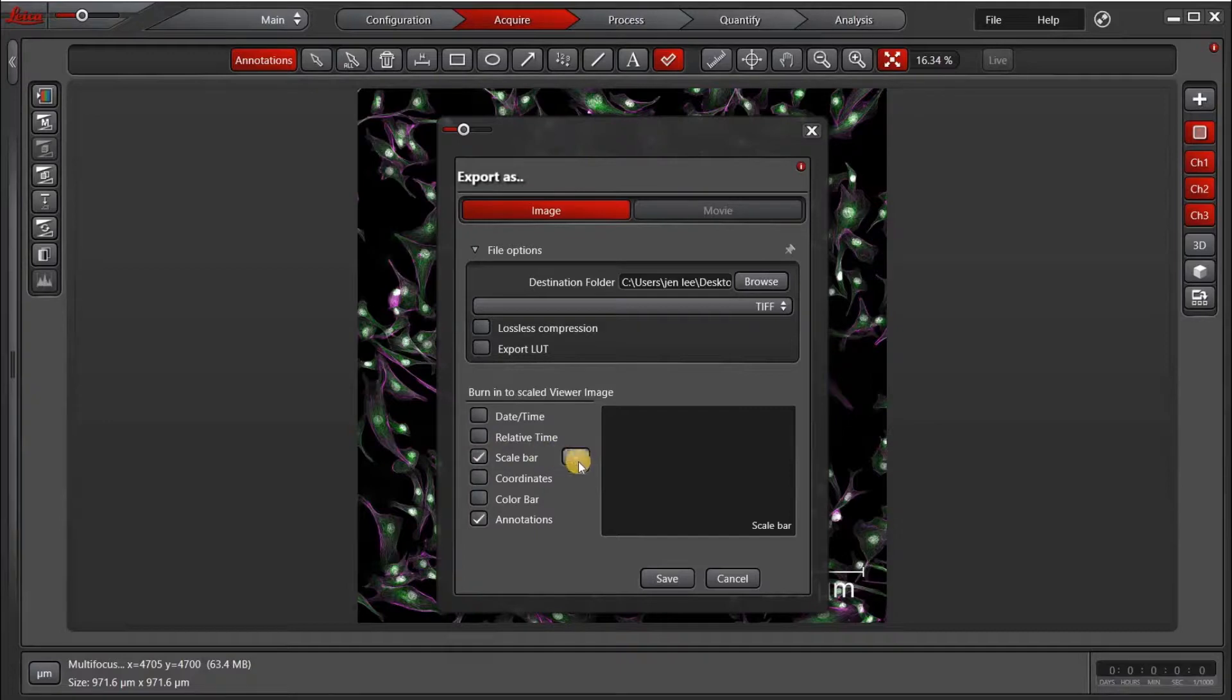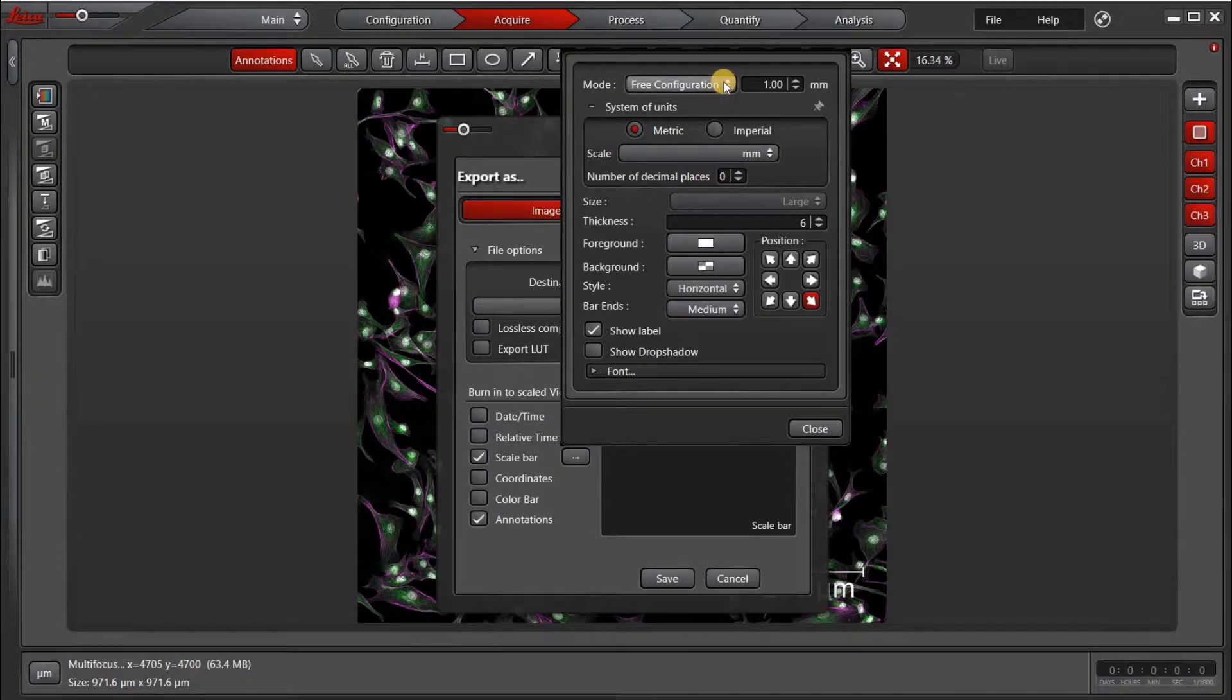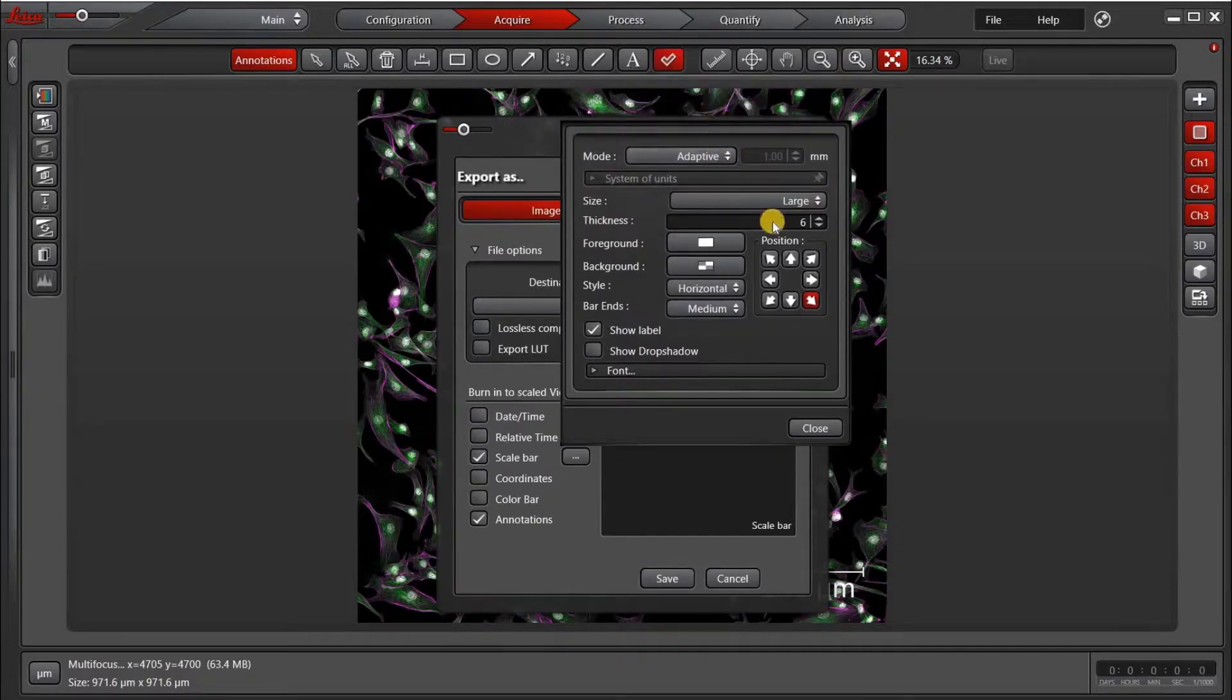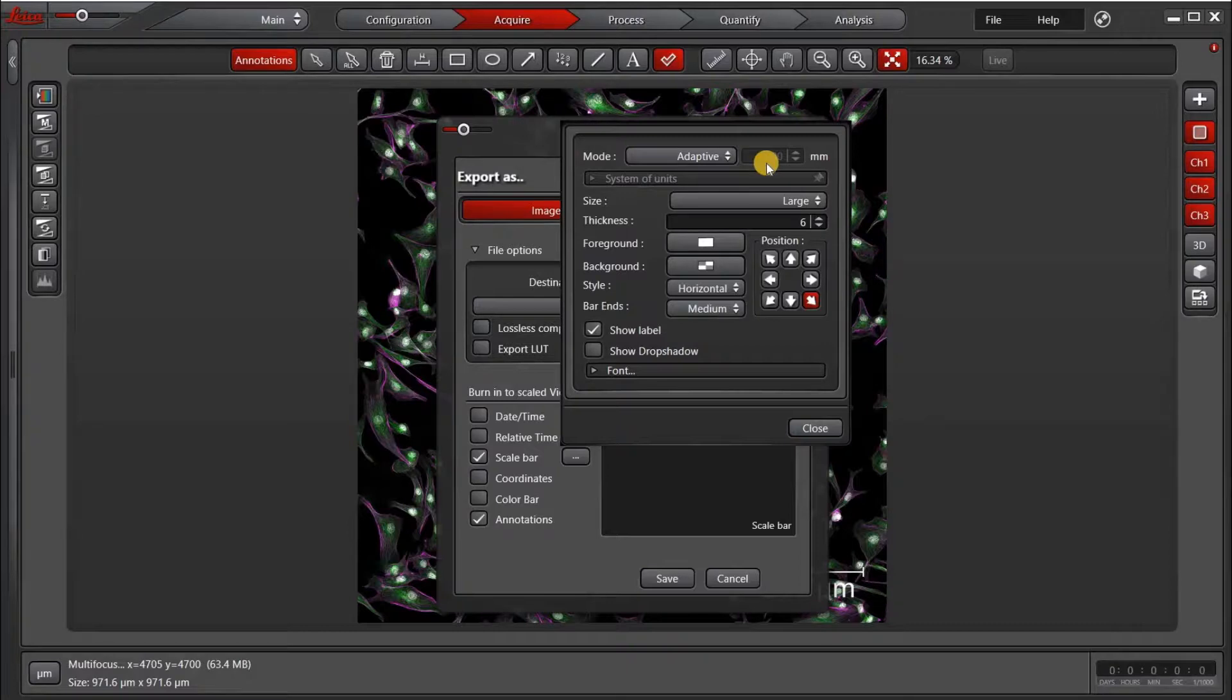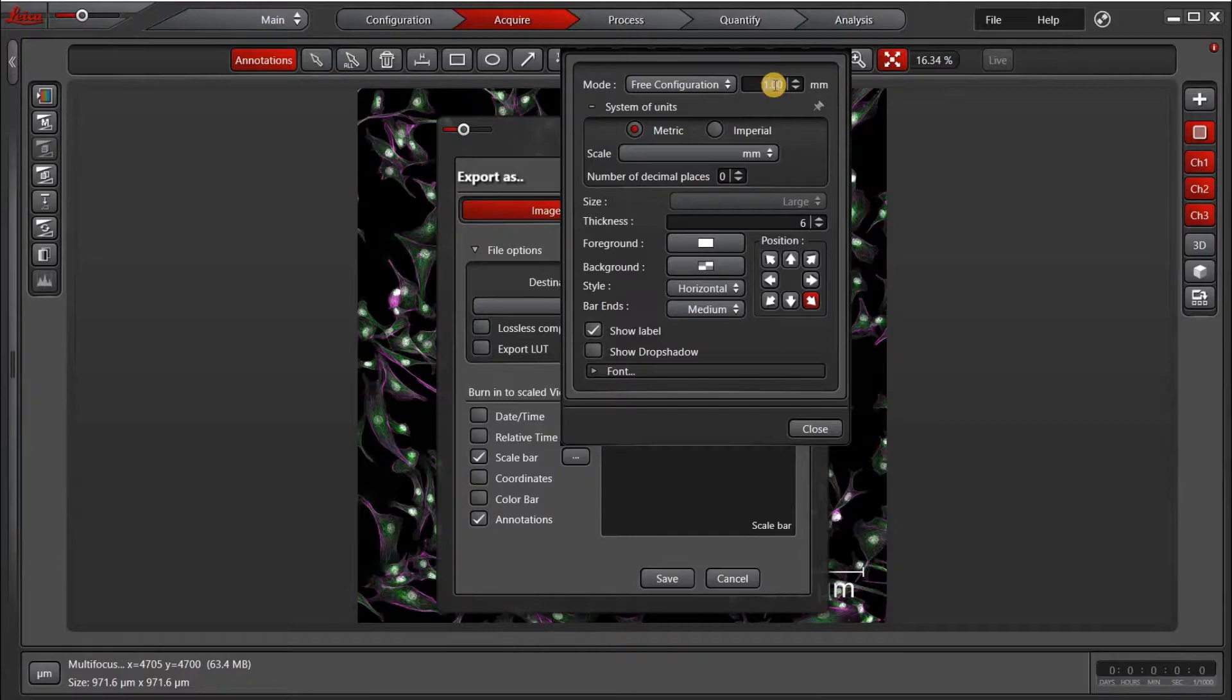So next to the scale bar, we have this dot, dot, dot. And here we can choose between different options. The first thing is to choose the mode. One is Free Configuration, and the other is Adaptive. Adaptive means it'll choose for you what it thinks is the best scale bar. I often use Free Configuration because I want to be able to make my own choice about the units that I'm using and how big the scale bar is.